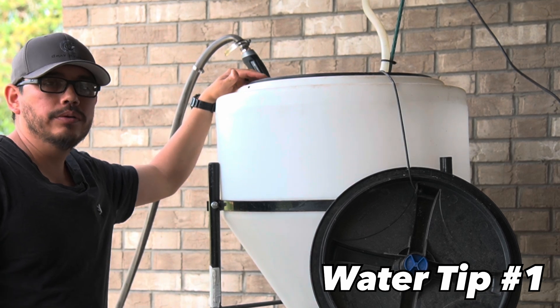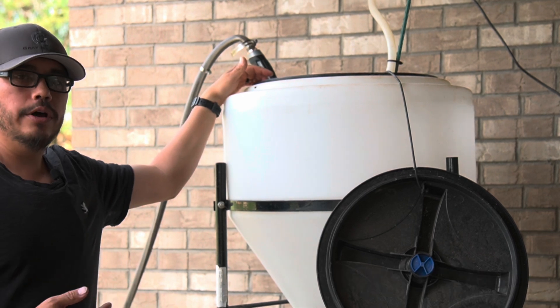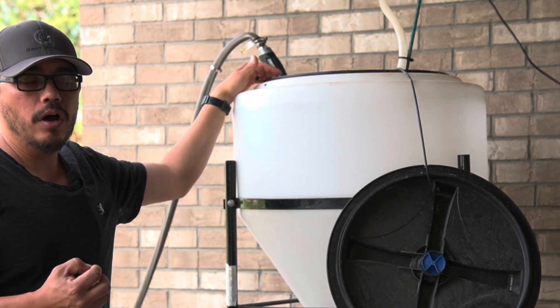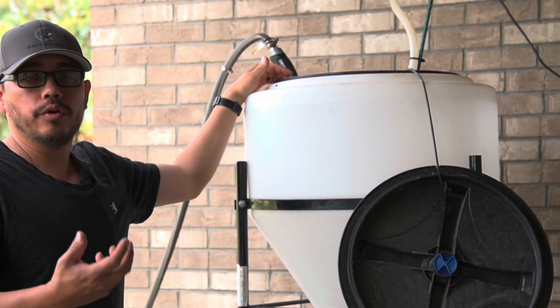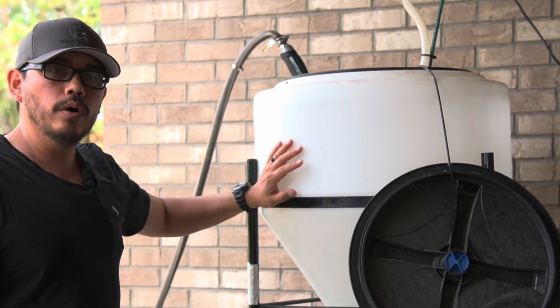I want the coldest water possible. Cold water has the highest percentage of dissolved oxygen, and we want that because organisms are aerobic — those aerobic organisms need the oxygen in the water. So cold water is always better.